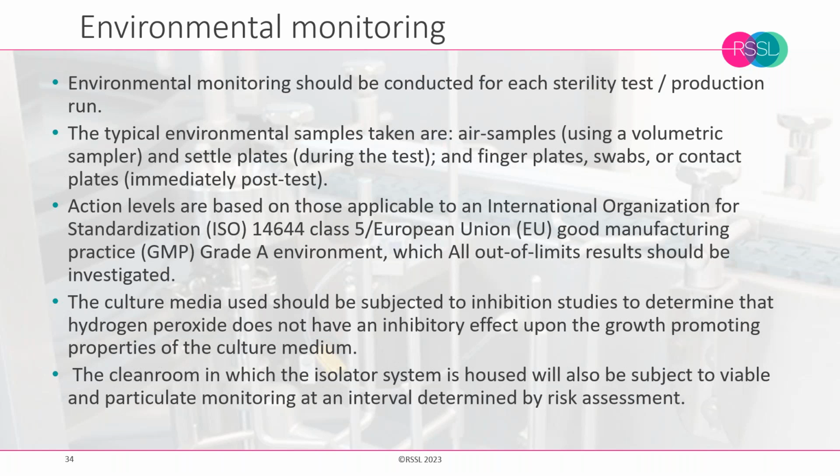So studies to show the suitability of the culture media to hydrogen peroxide, or if there was a micro crack in the bag holding plates, for example, if any peroxide got in, then it's not going to prevent microorganisms from growing.